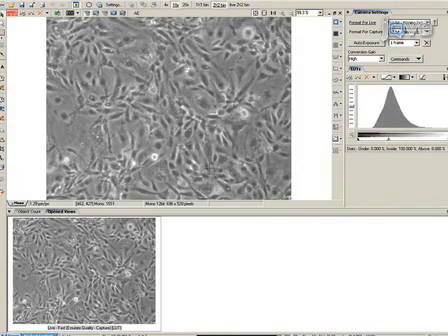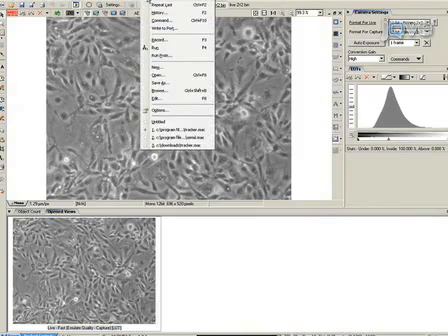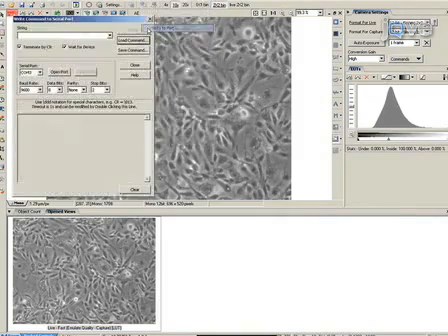Click on Macro on the menu bar and select Write to Port. Select Port COM3 and open. This opens the port to coordinate with the syringe pump. The flow chamber is now ready to be infused with KG1A cells.